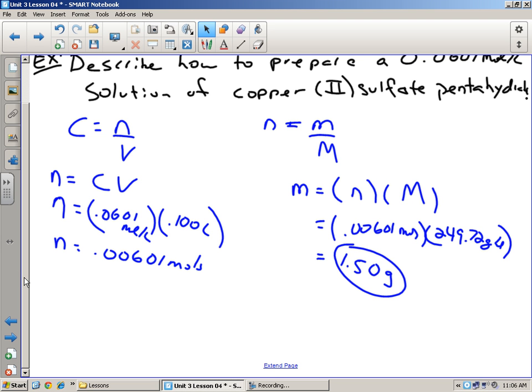There's green stuff everywhere, okay? Except in the beaker. It's on the scale, it's on the black, you can totally tell because it's black countertops. It's all over. Well, we don't like that, okay? Because then someone's got to clean it up, which is me. And secondly, you're wasting a bunch of stuff. Okay, and it's not very precise or accurate.